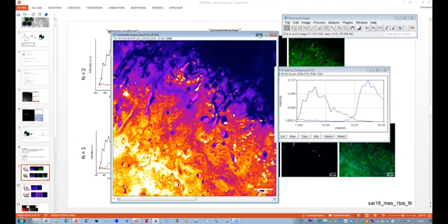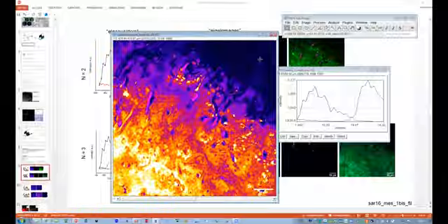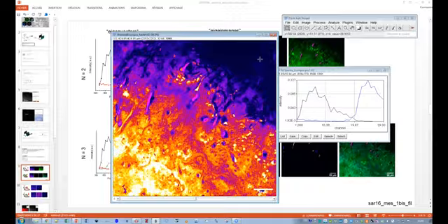Excuse me, Juliette, I have another question. The eigenvectors are linear combinations of the spectra. And how did you choose the number of eigenvectors? For example, according to eigenvalues, do you have the eigenvalues that explain the variability?